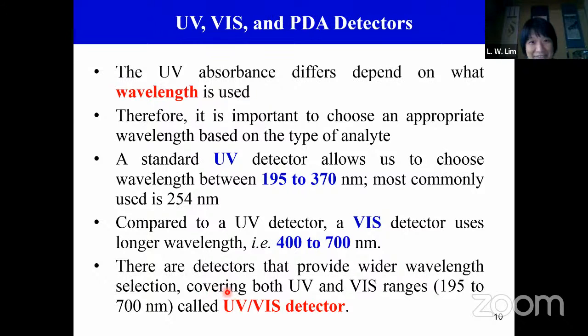Just now I had a question: is it correct to combine UV-vis and PDA for detection? Oh yes, you can combine. Is it better to combine UV-vis and PDA? Usually UV-vis is one set, because most companies want to sell it that way. If you just sell UV alone, it is difficult, because we want to use both most of the time.